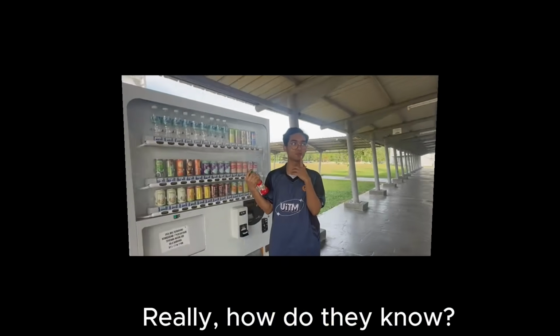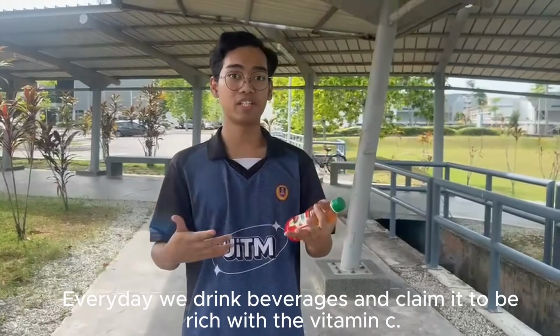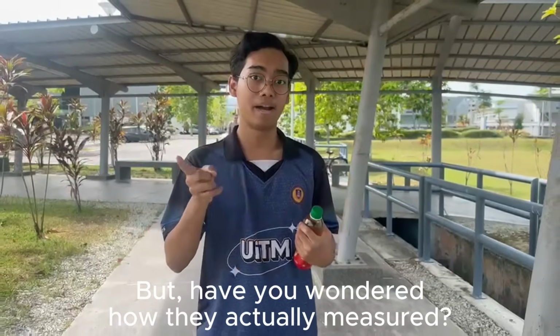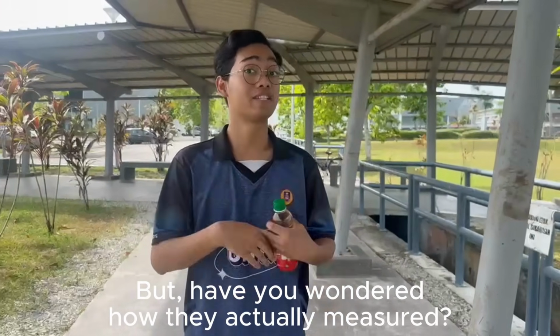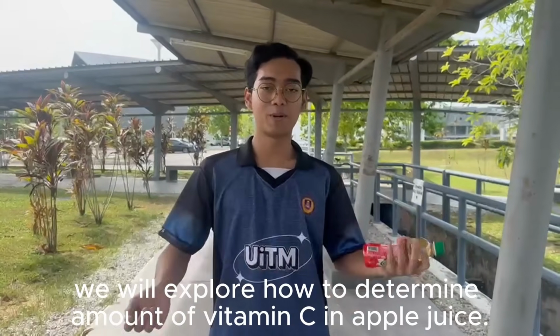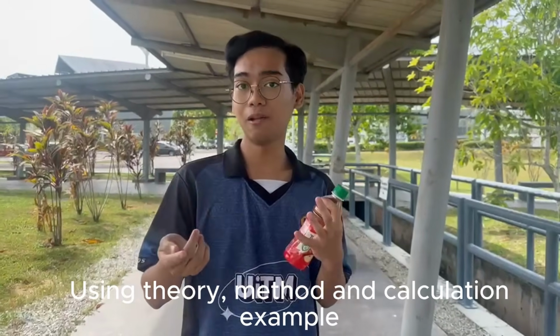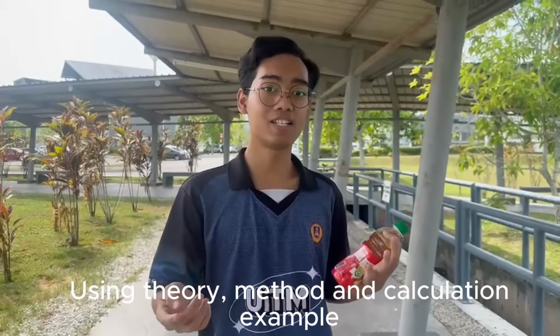How do they know? Every day we drink beverages claiming to be rich in vitamin C. But have you wondered how they are actually measured? So, in this video, we will explore how to determine the amount of vitamin C in apple juice using theory, method, and calculation example. Let's go!